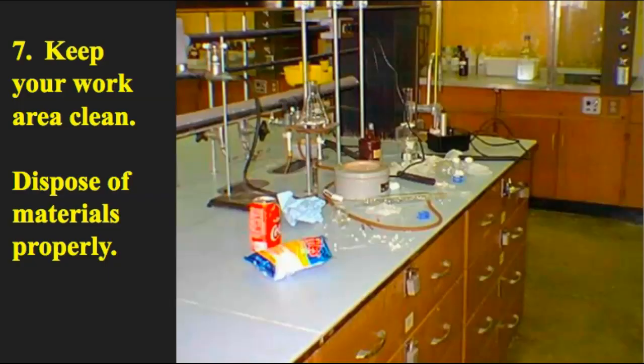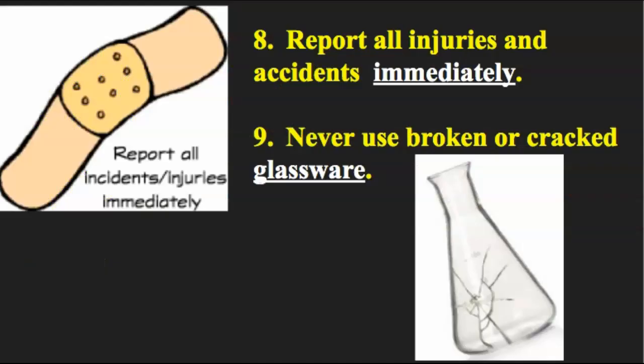Keep your work area clean. Dispose of materials properly. We talked about that before, and we will tell you how to dispose of materials properly and safely in our pre-lab time.